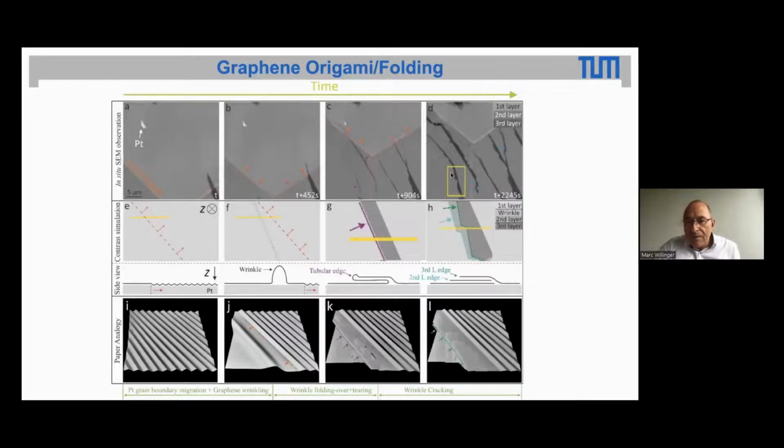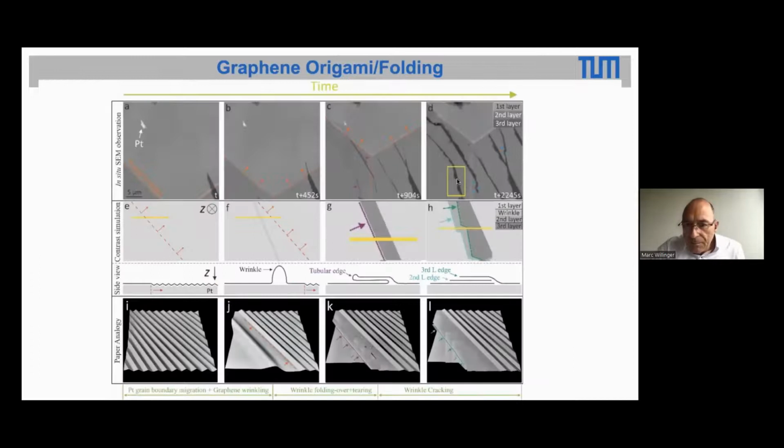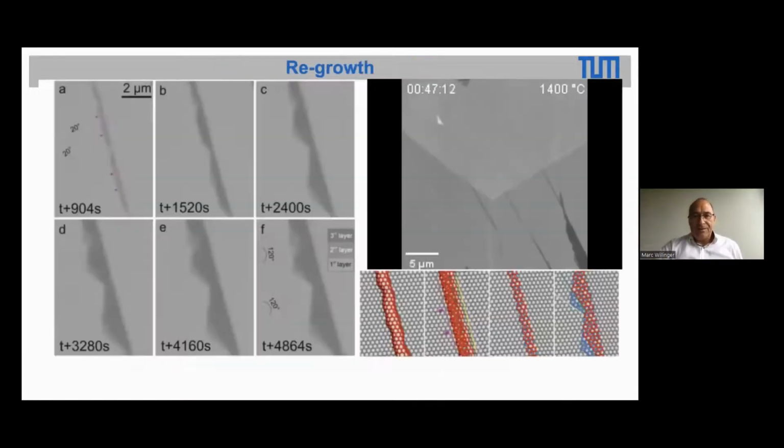That's the model, but you can see that, maybe I should zoom in. You can see that in the image here slightly. It's not very obvious, but I'll show you later. Maybe you can see it here. It's a different gray level. Anyhow, we did some DFT calculations and STM measurements, so we can see that the wrinkles really fall to a side. We form this structure. We can etch this structure. DFT confirms that the etching happens here. You make two new growth fronts when you cut open that folded wrinkle, and then you can regrow.